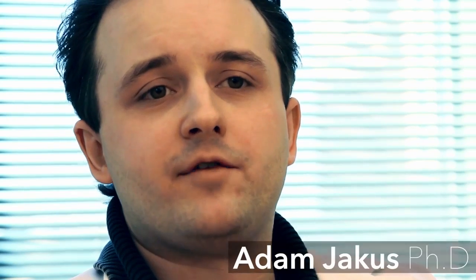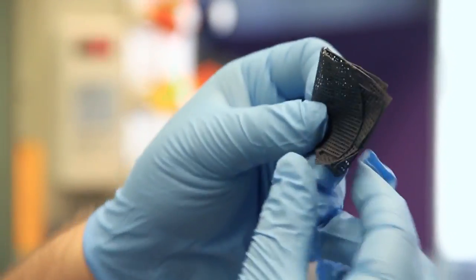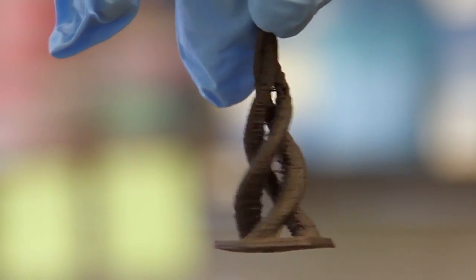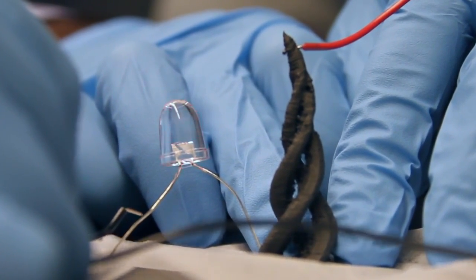With the 3D Bioplotter, I've really been able to focus on 3D printable materials development. The graphene work is quite interesting, and we're actually using this material to regenerate nerve tissue and muscle tissue in the coming future. So it's a very promising new biomaterial. It has great electrical conductivity, and it has great potential for non-biological applications as well, thinking for electronics and energy applications.